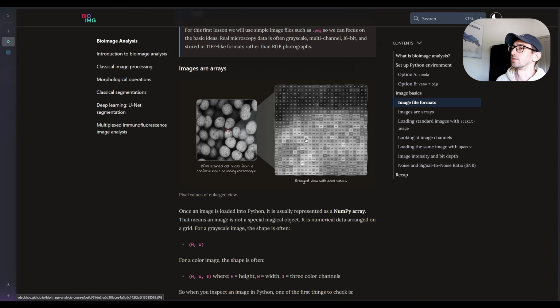Guys, don't be shy, please. Let's try to communicate. Any idea? Maybe try to count the sum of columns or rows. Yeah, for example. Something like that. And then we can, for example, identify which row has the highest value or something like that. Yeah, what are other ideas, guys, that you have?